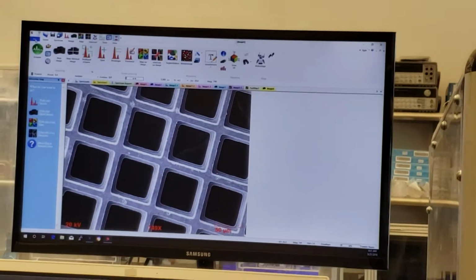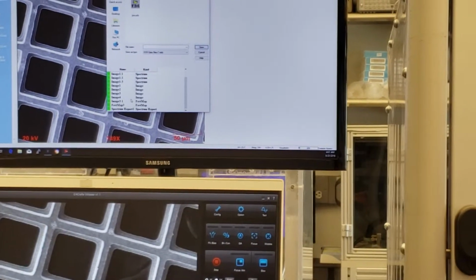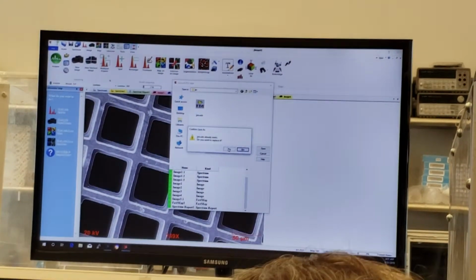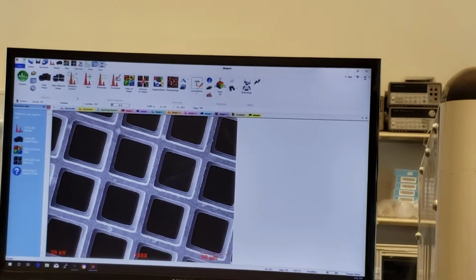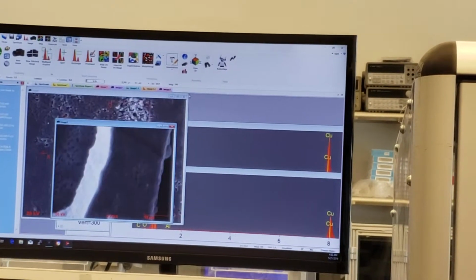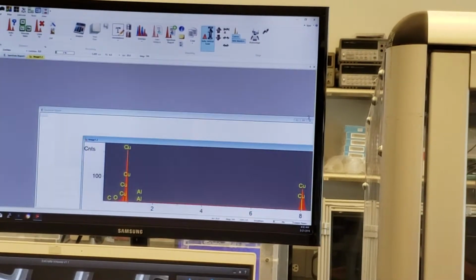And also if I do File, see what's a Save EDS Dataset? I can go Save EDS Dataset, and it's asking what would you like to save? I can just say I want to save all of it, and I'll give it a name. Let's say Jim. I'll replace it, so I'll just save everything as Jim. And let's say all this work that I've done here, because I've got all these windows open, maps, all this stuff. If I kill all this stuff, and if I come in tomorrow or whenever and I want to look at that job I was doing, just get rid of all this stuff.